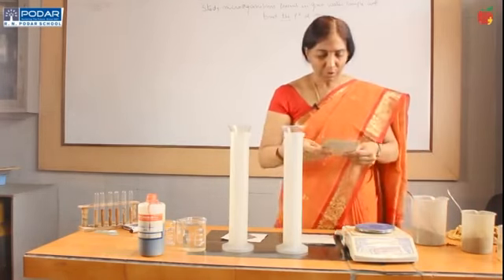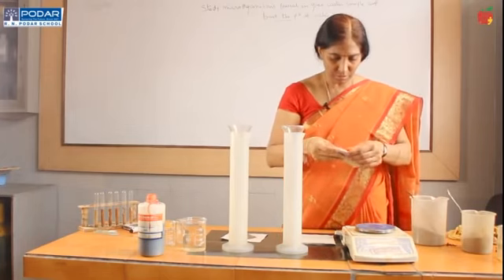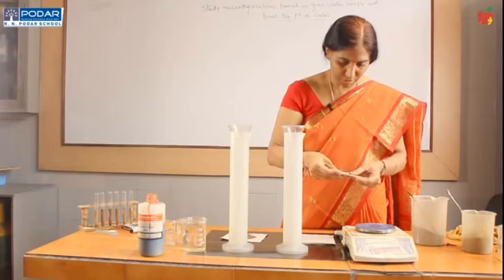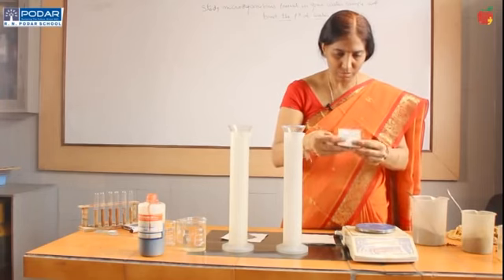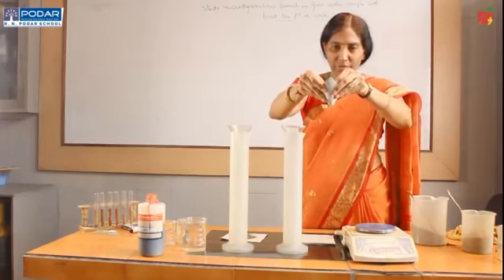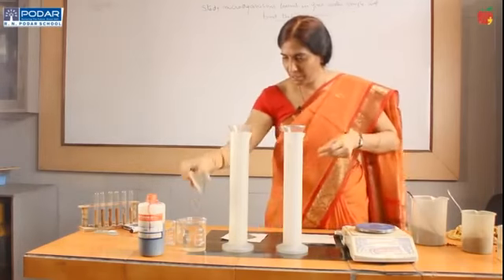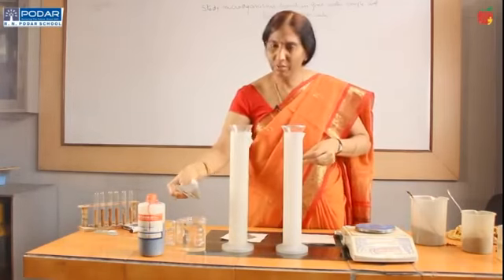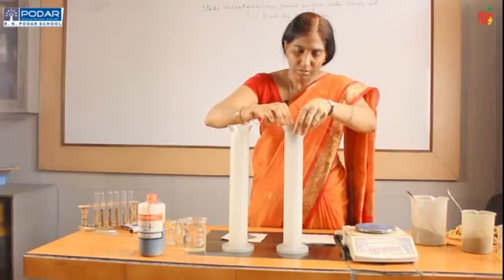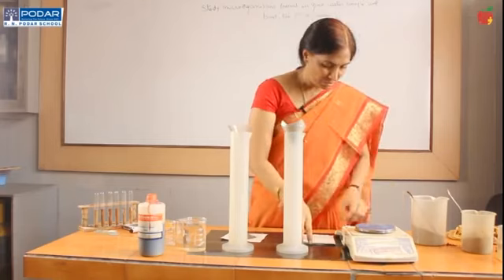Now, I am going to prepare a funnel. I am taking filter paper and folding it like this, four folds. You have to prepare the funnel like this, then dip it in water so that it will stick to the walls of the funnel.